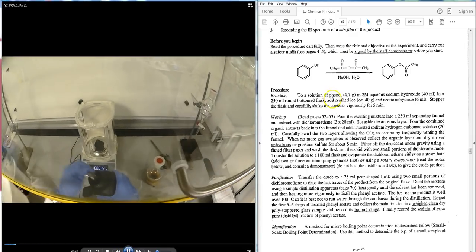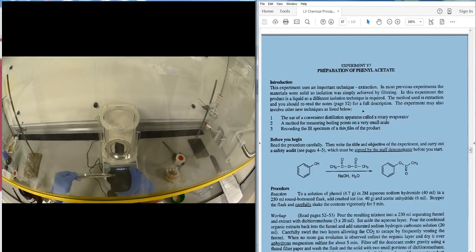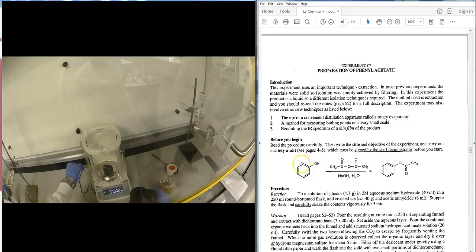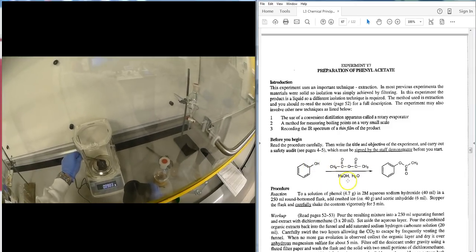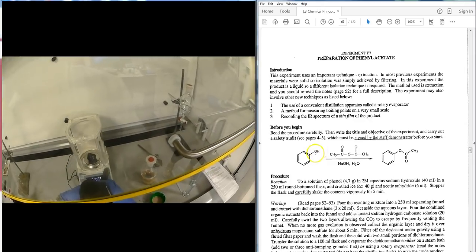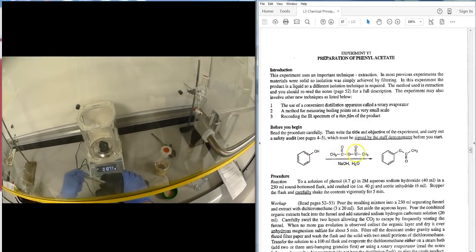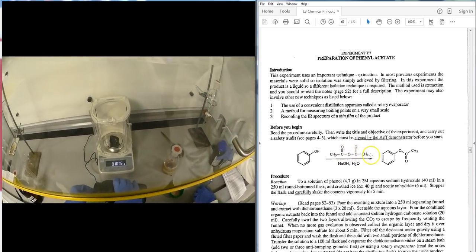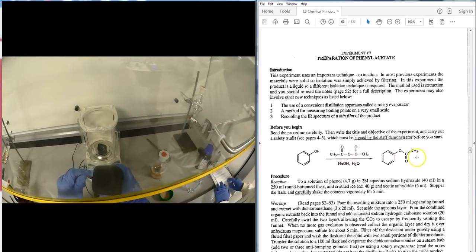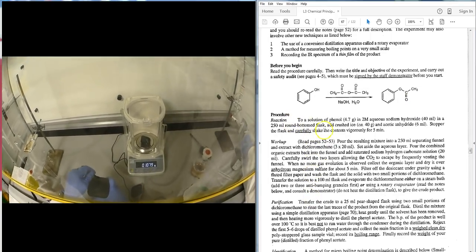This practical is Y7, the preparation of phenyl acetate. Phenol is placed with sodium hydroxide to remove the proton and form phenoxide, which undergoes nucleophilic attack towards the carbonyl group, followed by elimination of the ethanoate group to form the ester.